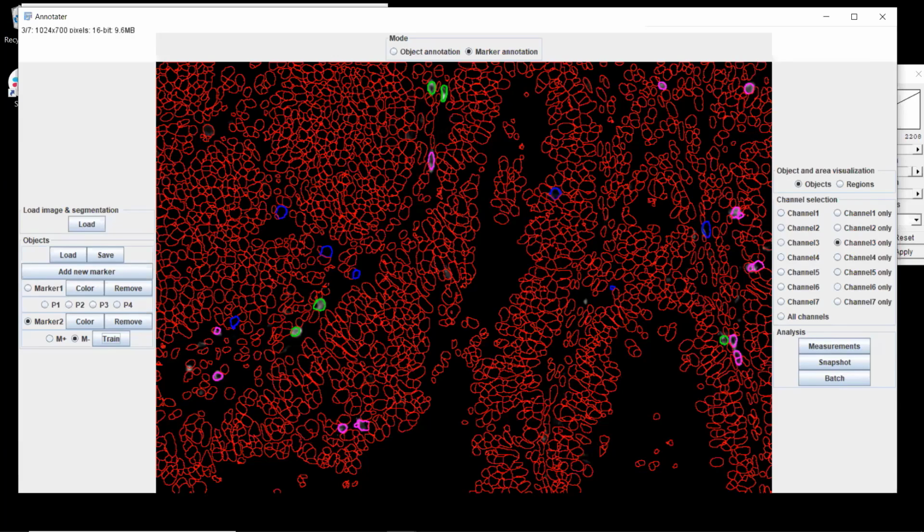Same thing for cytoplasm. It also takes into account the size of the nucleus, and finally the shape, so the ellipticity, depending on whether it's round or elongated. So that's great. You can have all the features because, for example, if you were to identify endothelial cells, they are very elongated, so taking into account the ellipticity is also of interest.